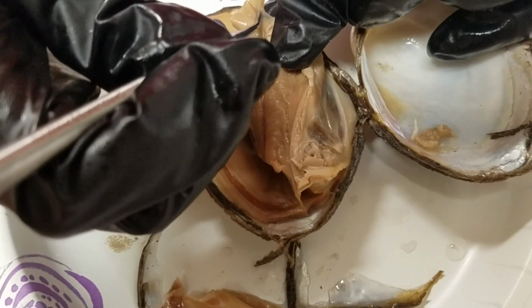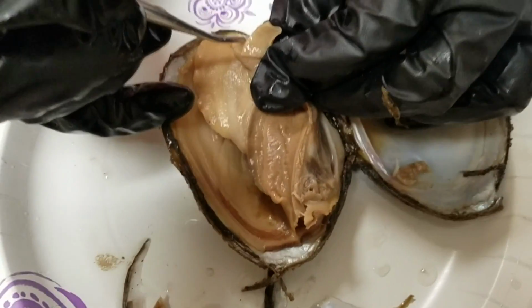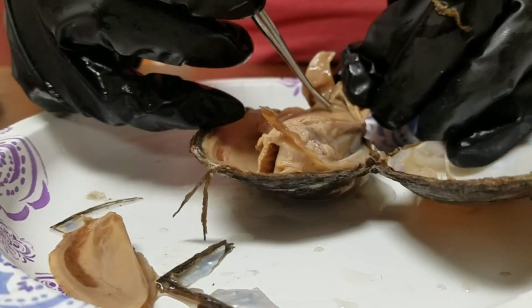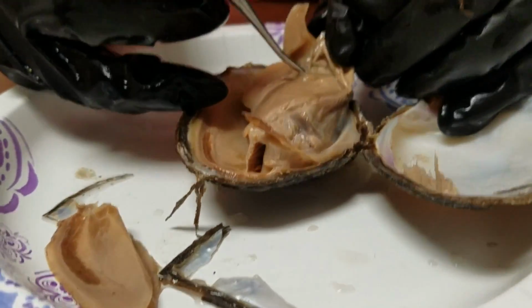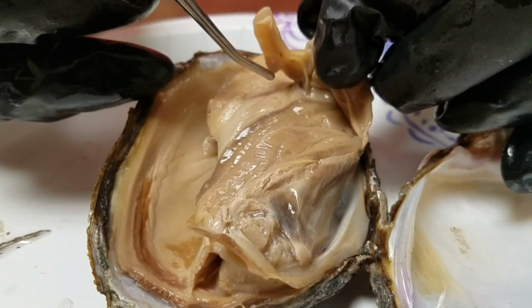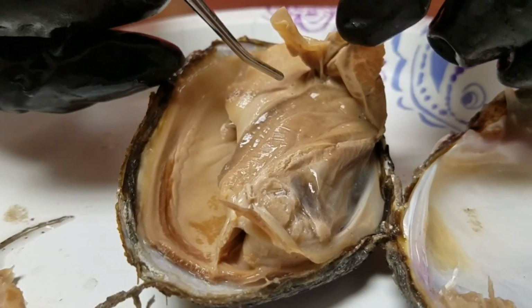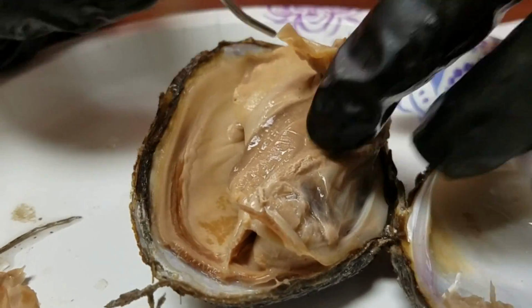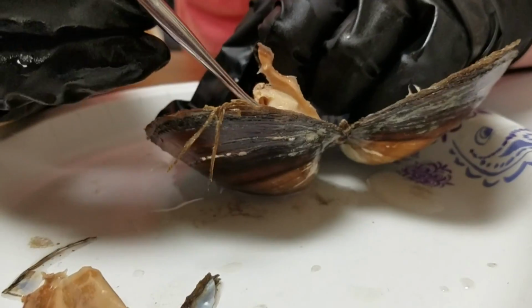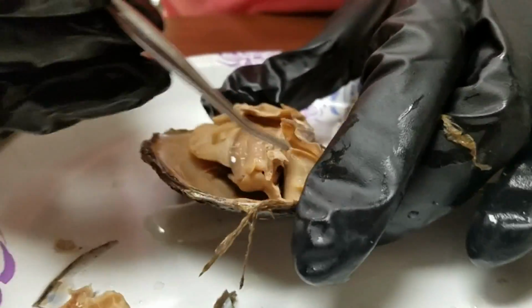Oh, you stupid thing. Gosh, dog it. So anyways, your labial palps are going to direct you to where the mouth is on the clam, or sort of mouth. Okay, foot, visceral mass. And then you also have, let me see if I can find them, we have muscles here.